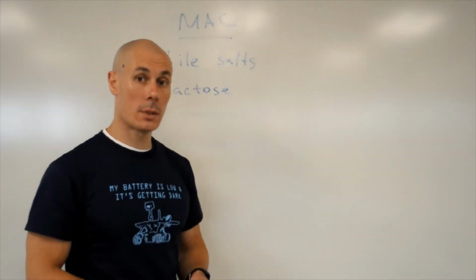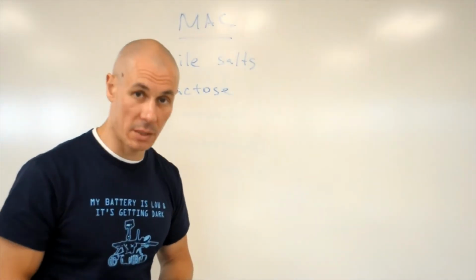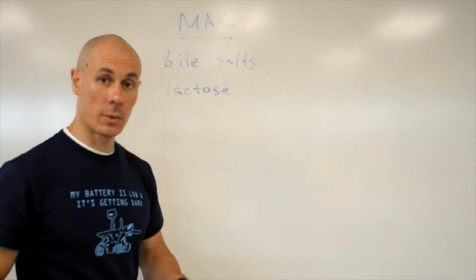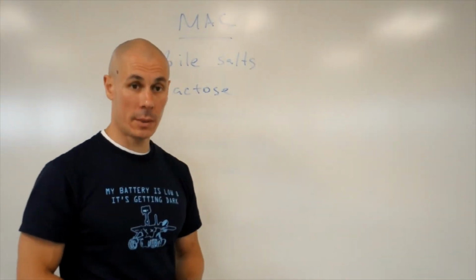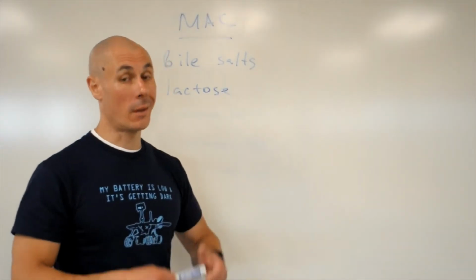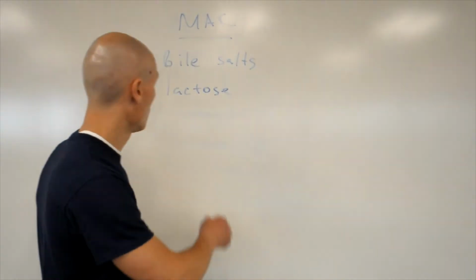It allows you to distinguish between lactose fermenting and lactose non-fermenting microorganisms. Normally, these bile salts will inhibit the growth of the vast majority of gram-positive bacteria, but they will not inhibit and will allow the growth of gram-negatives.